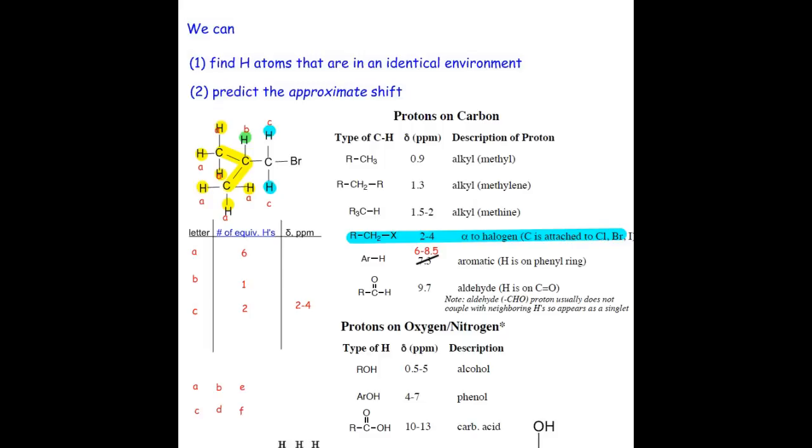Then I'm going to take a look at my B, what I labeled B, and it's a hydrogen attached to a carbon that's attached to 3 other carbons. That's this one. A hydrogen attached to a carbon attached to 3 other carbons. That's between 1.5 and 2.